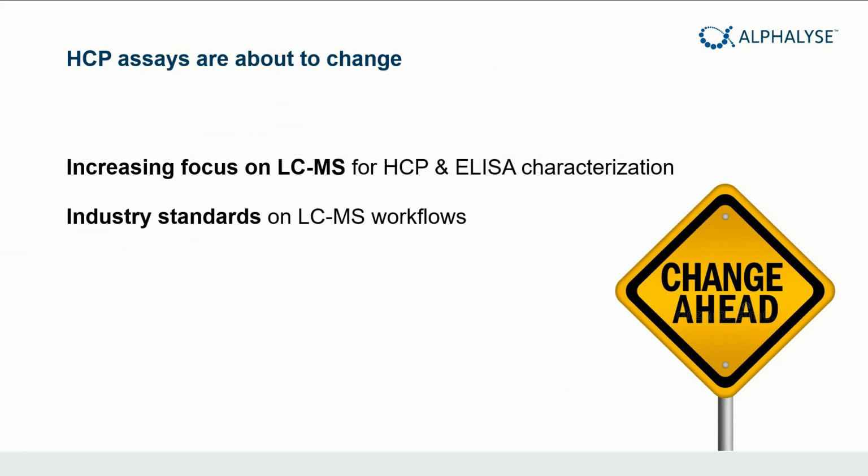There will be new industry standards on what LCMS workflows to use. That will be directed, and best practices will be described in the USP chapter. The LCMS results will enable you to do a risk assessment on your product, whether there are problematic HCPs in your product, and if they should be further removed, or if they are acceptable for your clinical trials.